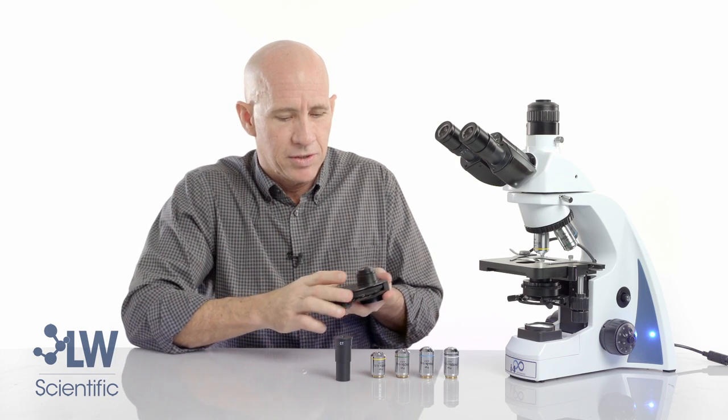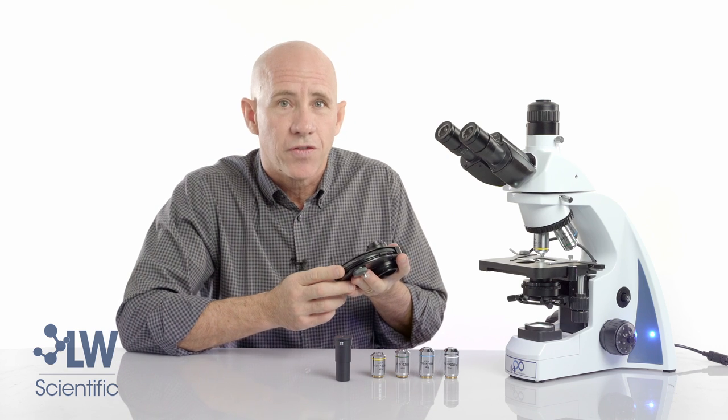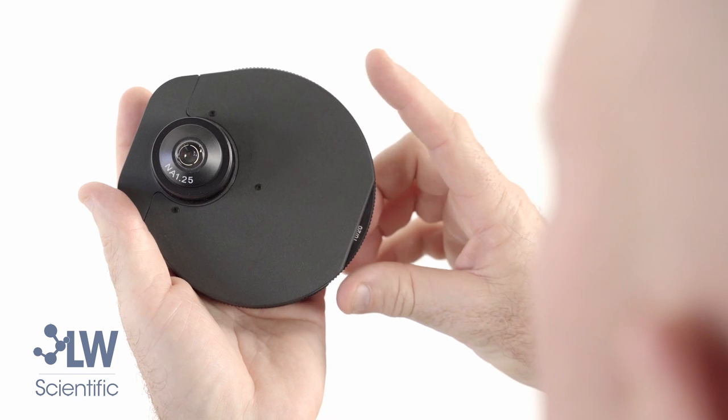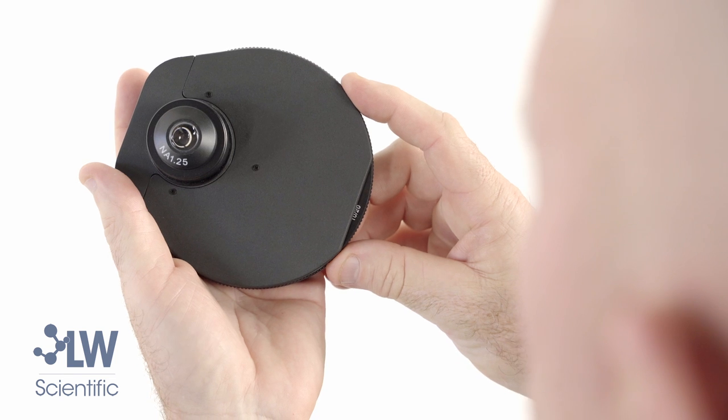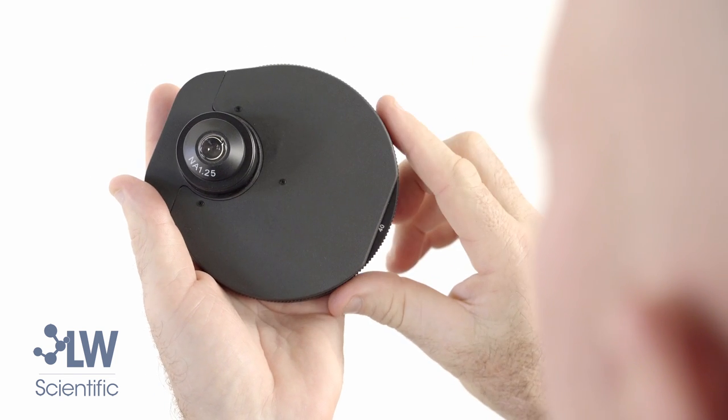Now let's talk about the phase contrast turret condenser. This condenser has five different settings built into it. The condenser has a 10x/20x phase setting and a 40x phase setting.